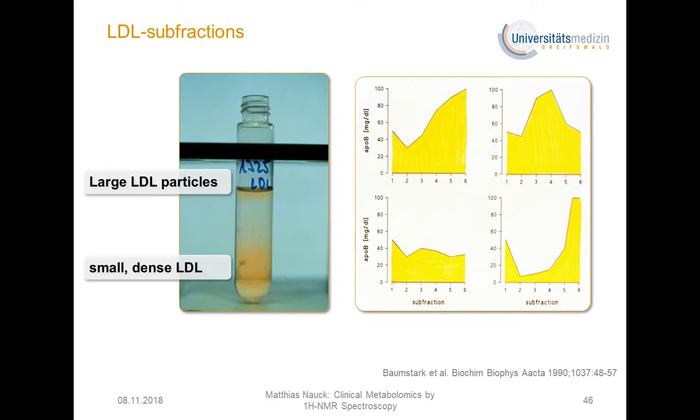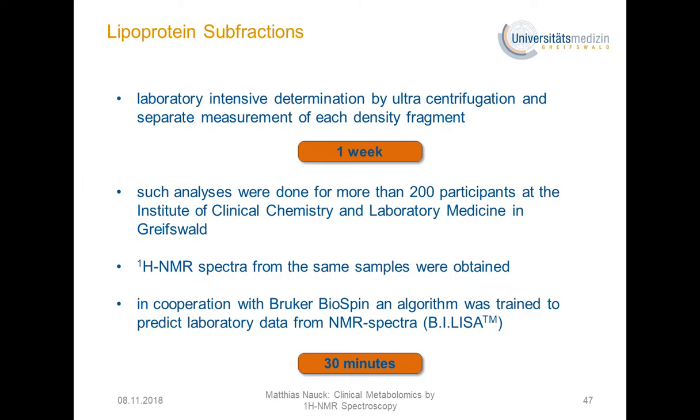So very poor are the small dense LDL and in part the large LDL particles, whereas the in-between LDL particles are not so dangerous in view of the development of cardiovascular disease. So the analysis and preparation of these lipoprotein particles is, with the classical instruments, quite time intensive, and we need about 1 week to prepare these samples.